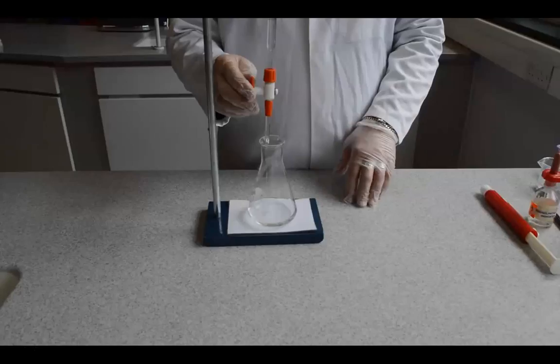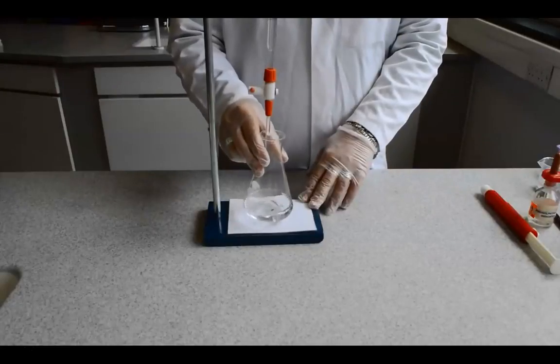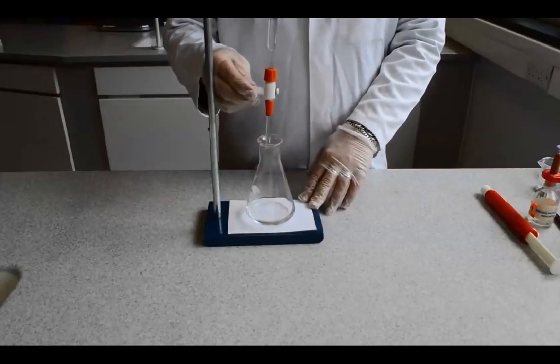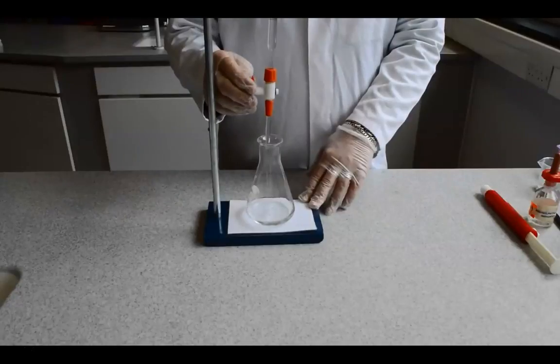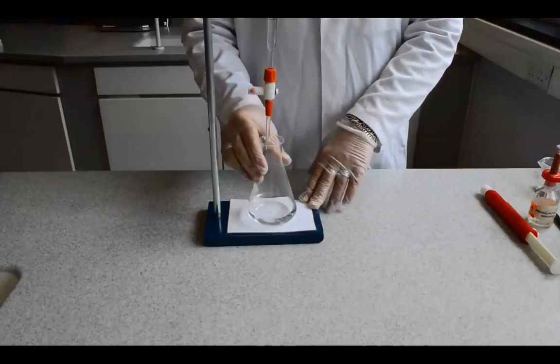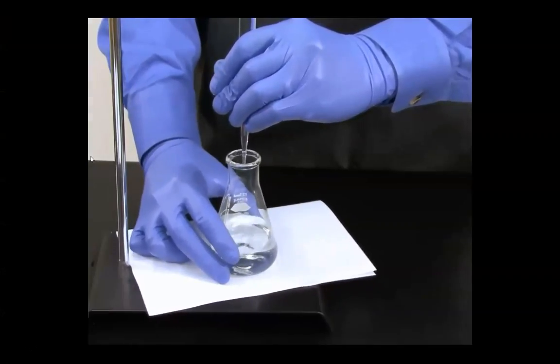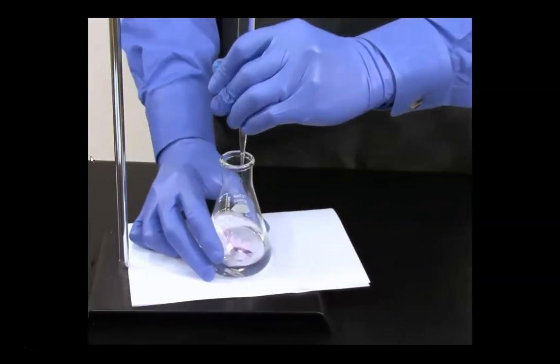This is not a good technique. It is both awkward and inefficient going back and forth like this. Sliding the flask back and forth is not quite as bad, but it's still more awkward than a nice swirl from the neck.